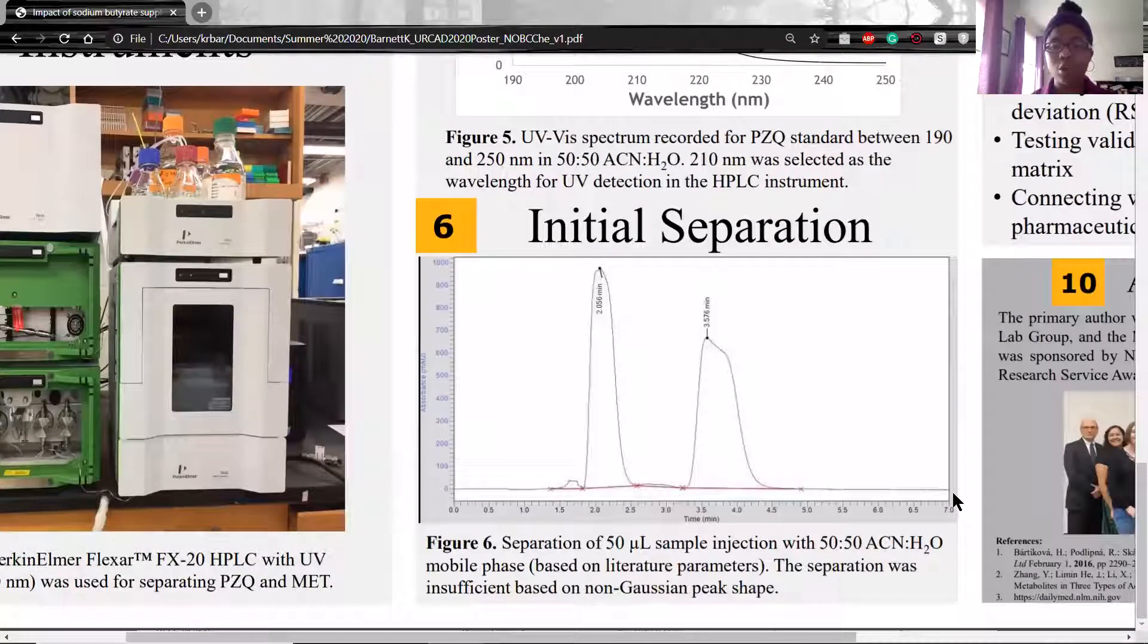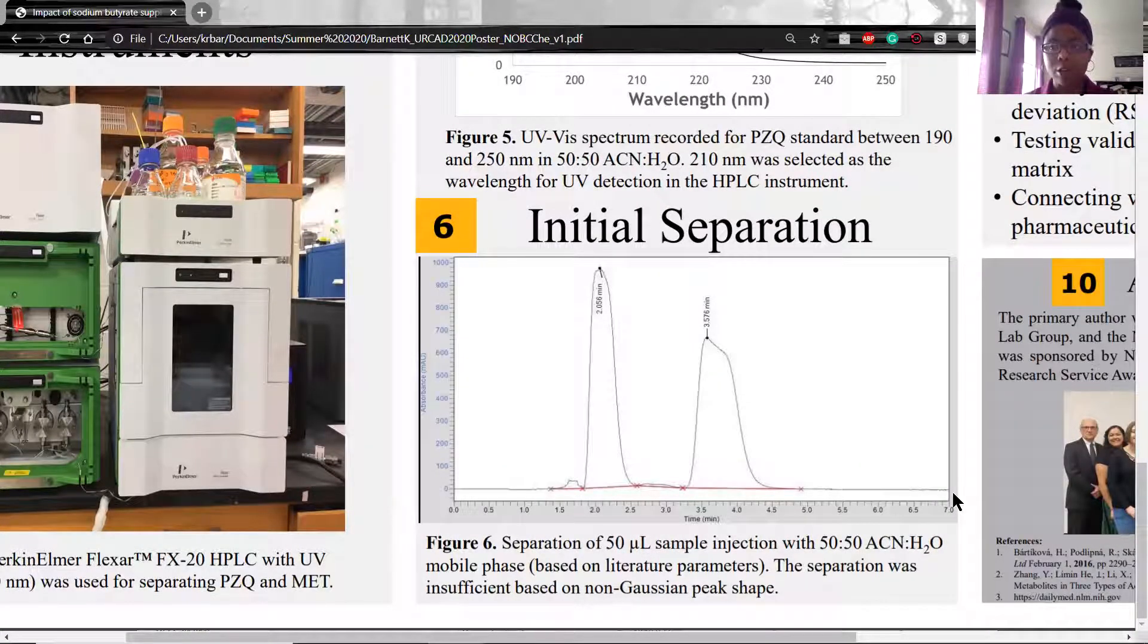In section 6, we get to our first results of this research. In this chromatogram here, we can see that two compounds are identified. However, they're not very quantifiable because they have non-Gaussian peak shapes.